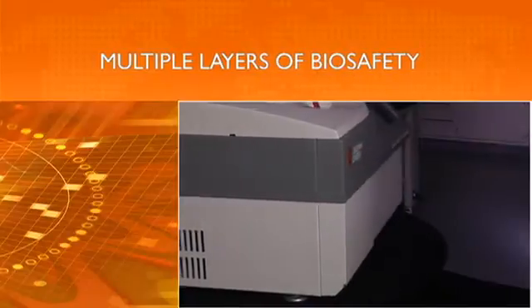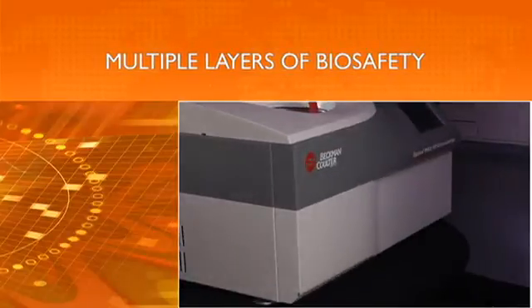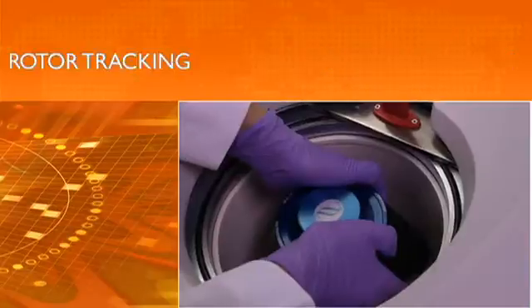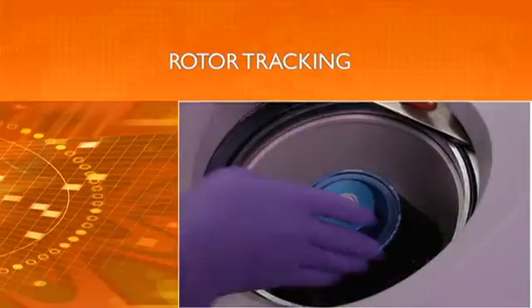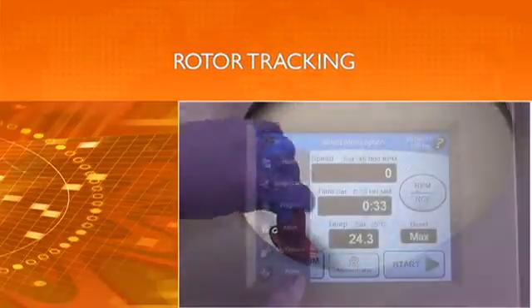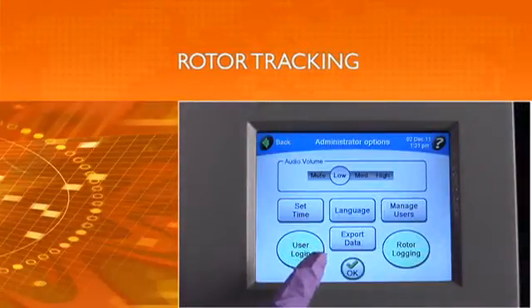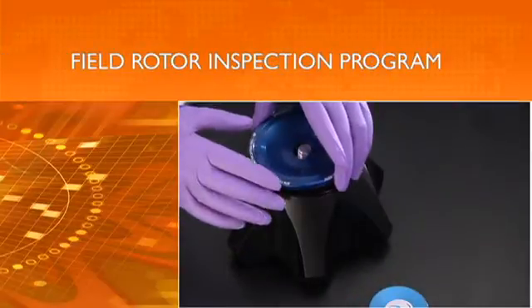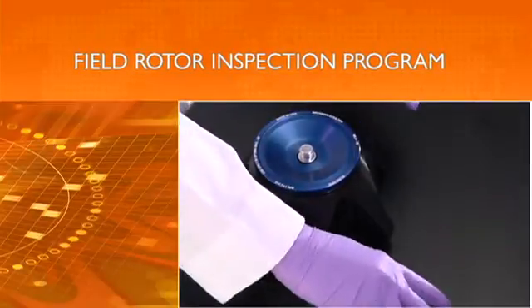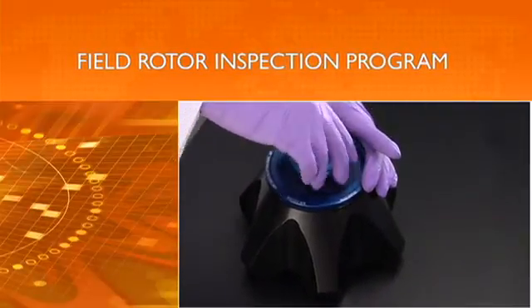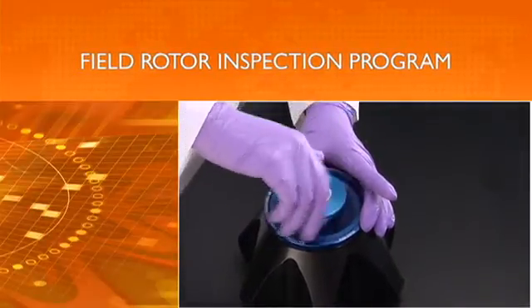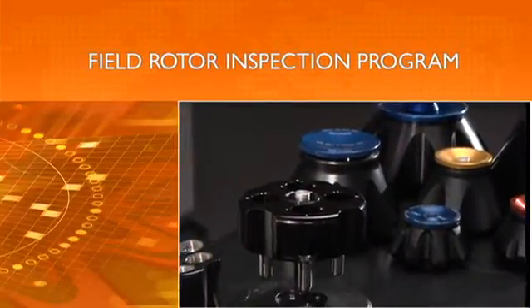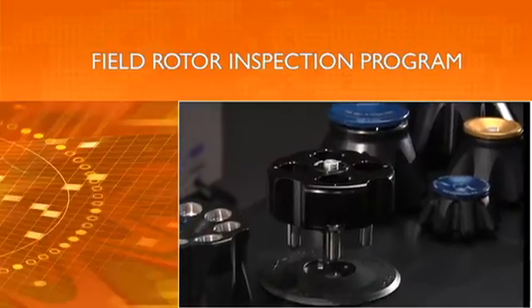The optional HEPA filter combines with innovative Beckman-Coulter rotors and labware to offer a multi-layered approach to biosafety. The MaxxP tracks your rotor usage so you always know where your rotors are in their life cycle, reducing the possibility of system malfunction and improving safety. We also offer our unique Beckman-Coulter Field Rotor Inspection Program that protects your investment by providing periodic on-site inspections to assess rotor safety and track repair data, ensuring the full, useful lifetime of your rotors.